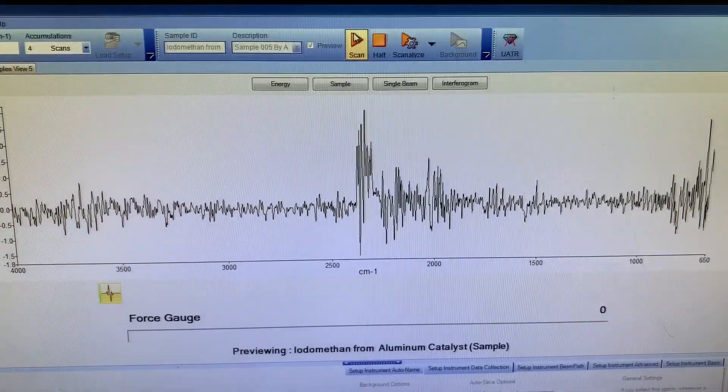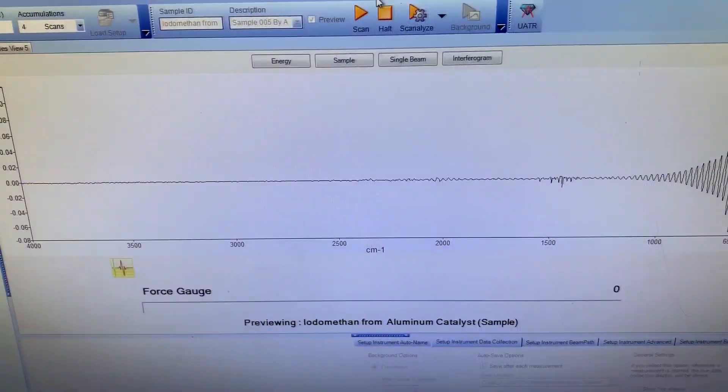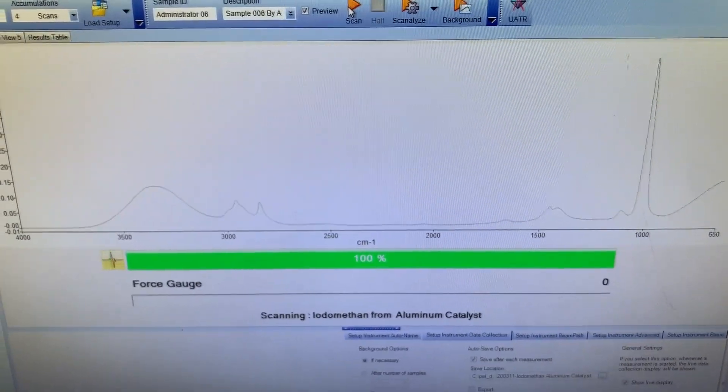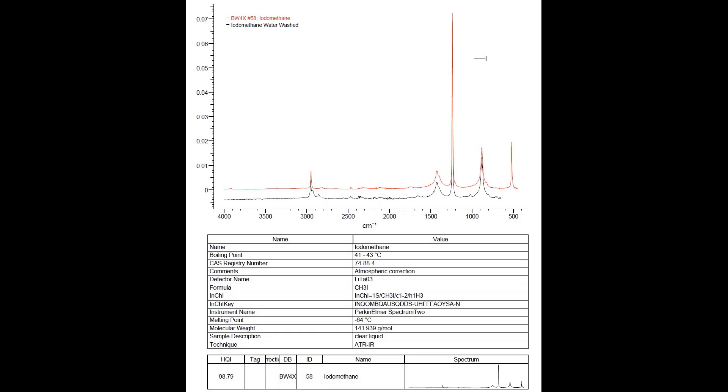Now that I've done that aqueous wash, I go through the same steps, placing the sample on the ATR and getting another spectrum that I then search. What this shows me is that I definitely made iodomethane. I have the red spectrum which is the reference spectrum from the database, the black spectrum is my sample spectrum, and in the bottom left-hand corner I have my HQI, my hit quality index. The closer that is to 100, the better my match, and it tells me I have a very good match and definitely have this compound.